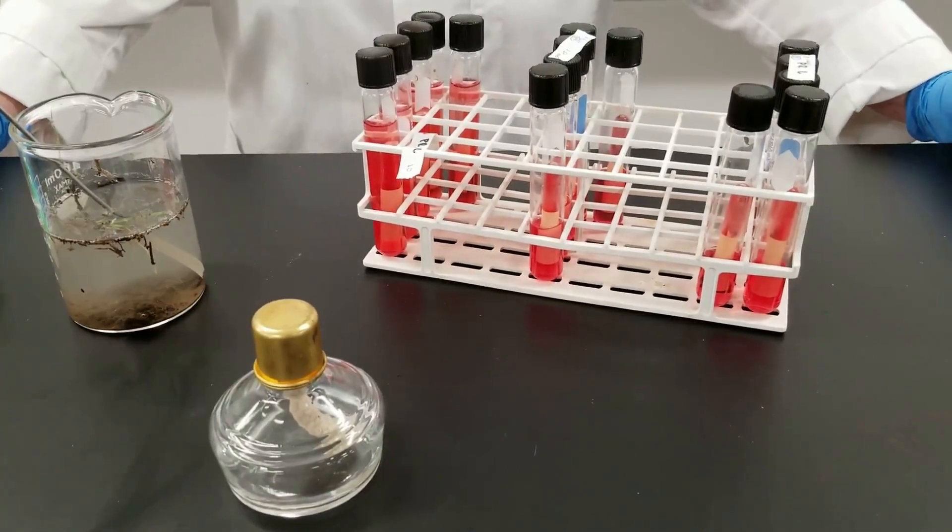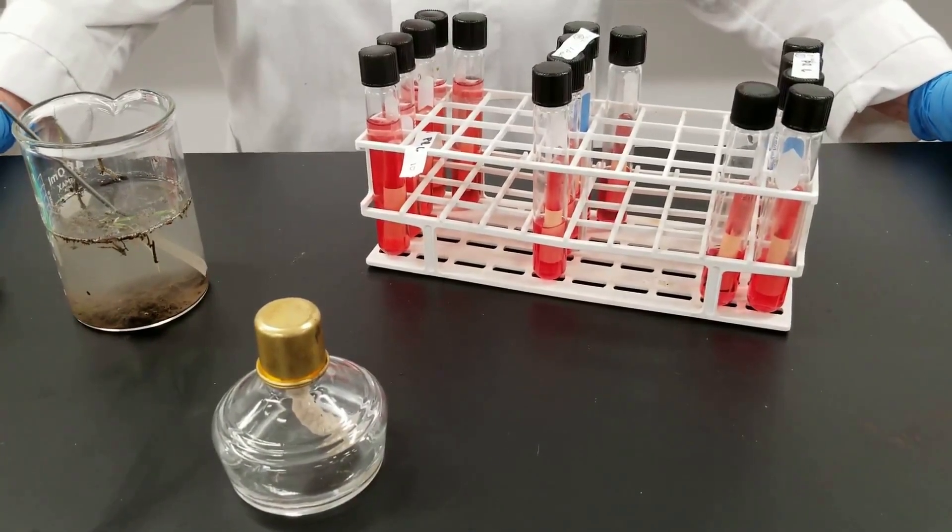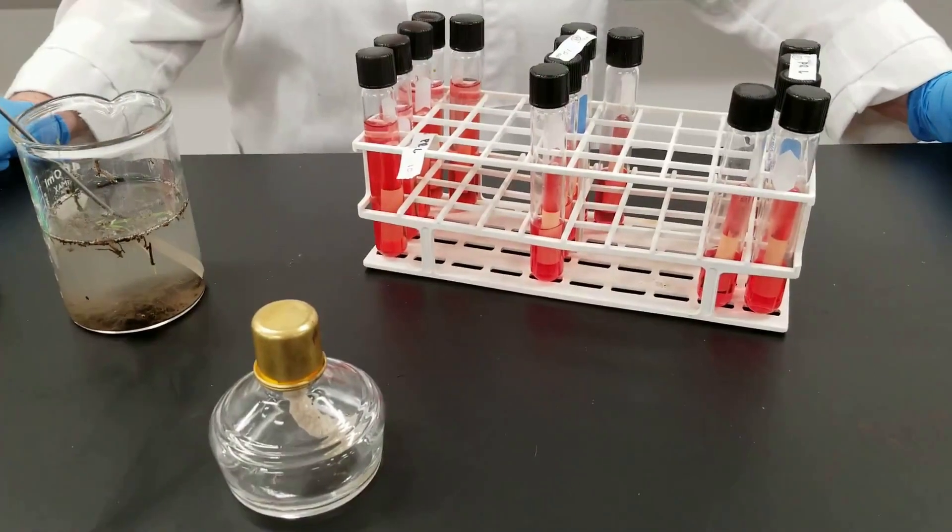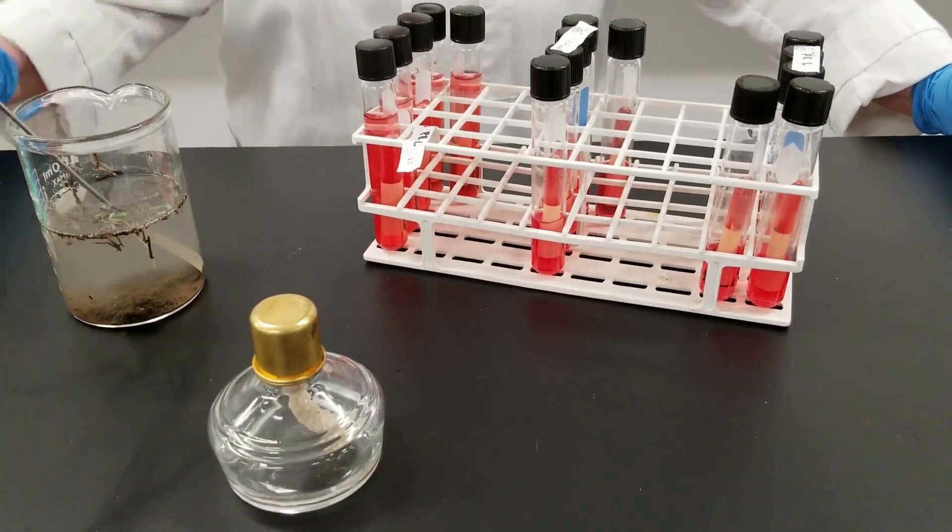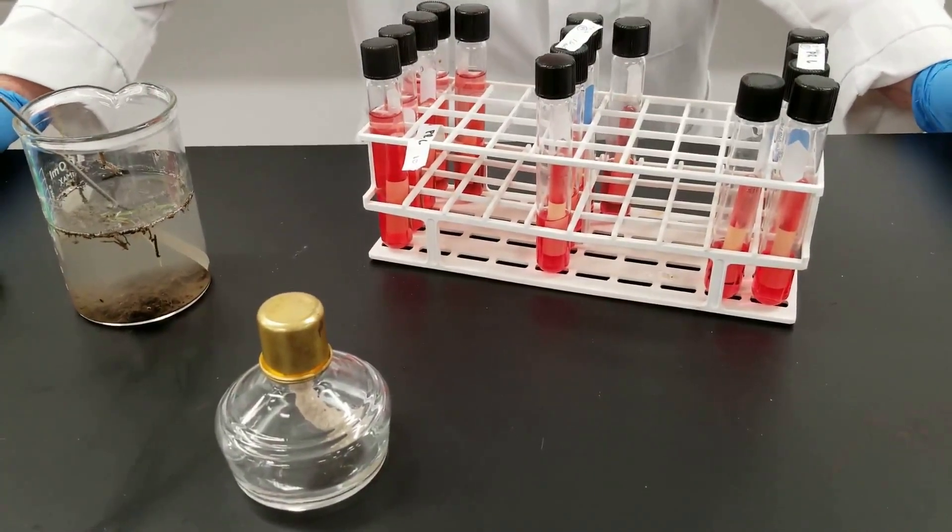One of the things that you're going to have to do is determine how many bacteria are in the water sample, so per milliliter, what's the concentration. Usually you're looking at the bacteria. There's numerous ways of doing this.